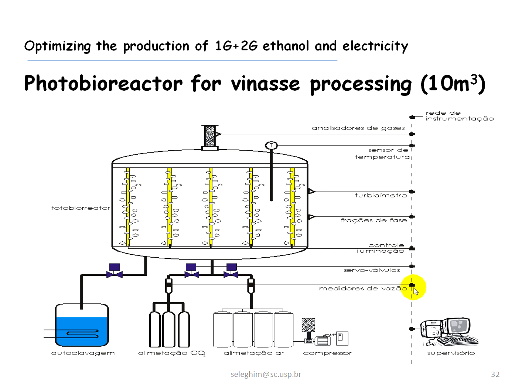Okay, it's also going to be instrumented. We're going to have light sensors and so on, and we want to test all this in order to see if we can obtain high algae concentration at large scales. Because if you look at the literature, you see that very high concentrations are something around 5 grams per liter or 10 grams per liter, but in very small reactors. We want to achieve, this is our goal, these concentrations at these scales.